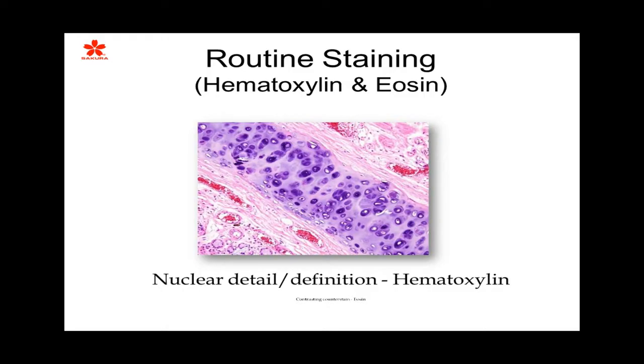So what we're talking about is hematoxylin and eosin staining. And what I've done is I've put this up on the screen, and you should see an image right now of early cartilage cells. These are chondrocytes that are picking up a deep nuclear staining of the hematoxylin.